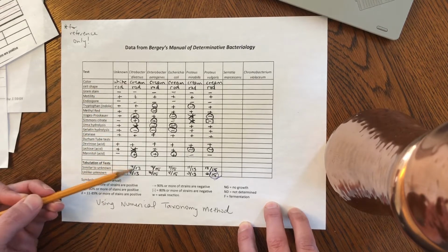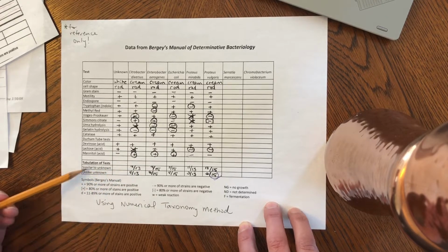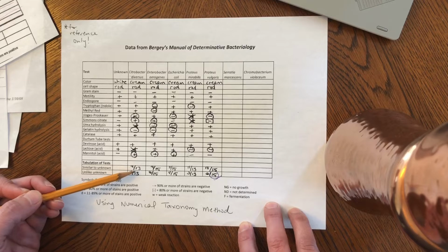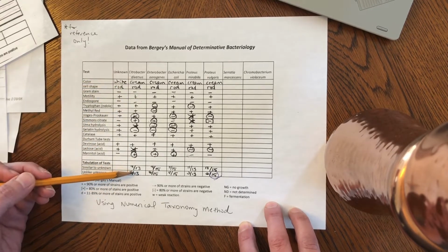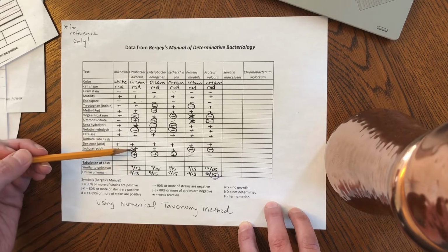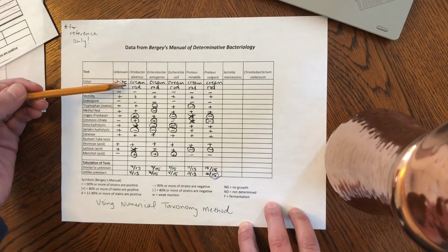So this 9 out of 13 ratio is how many test results are similar to my unknown compared to how many tests I can compare to my unknown. So we're going to go down the line, all the test results that we can compare to our unknown, and we're not going to count the ones that are crossed out, the D's. So here we go. And color is a matching countable thing.